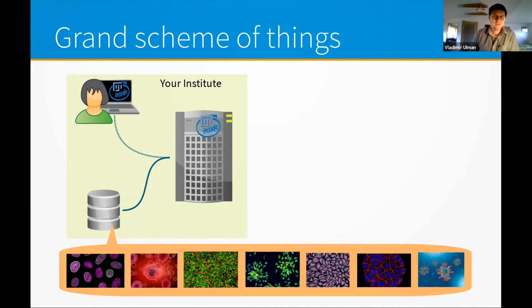Because this is the typical scheme, as my experience shows me: when we have a couple of images we want to process, we take one and open it in Fiji, right? We usually start the macro recorder, and then we do something to the image. We somehow try to process it, manipulate it. Eventually, we hopefully reach something that we are happy with.